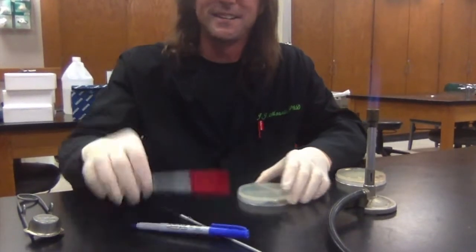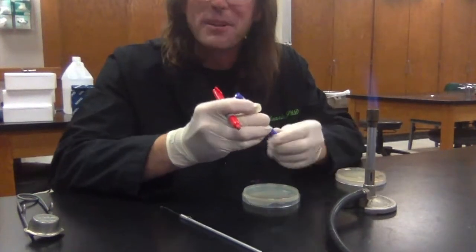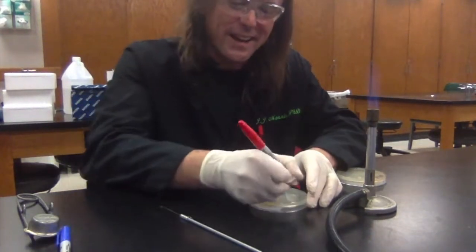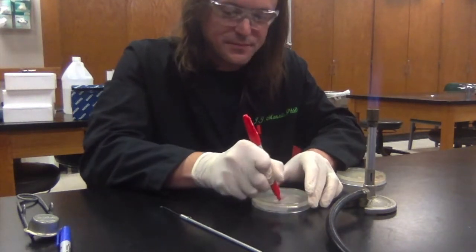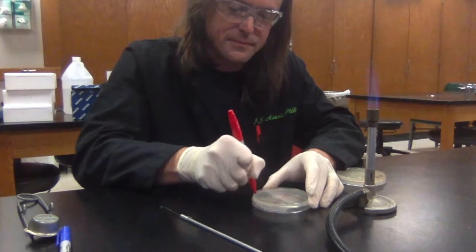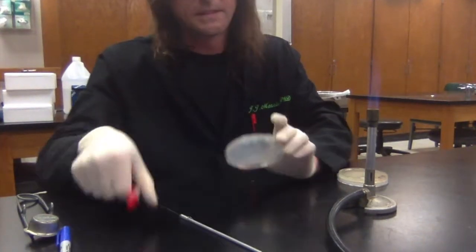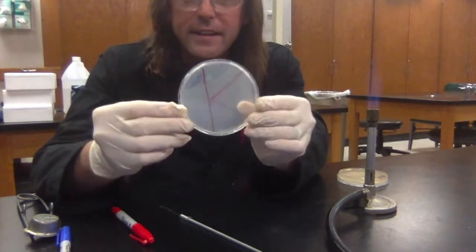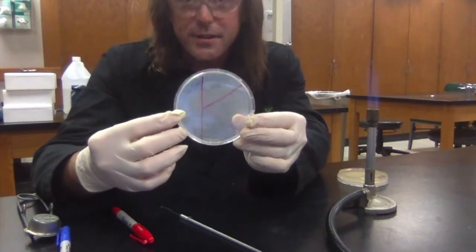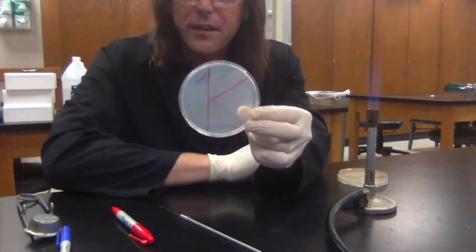The next thing I'm going to do is draw a big capital K on the back of my plate. This divides the plate into four sections, and I'm going to do something a little different with each one of these sections.